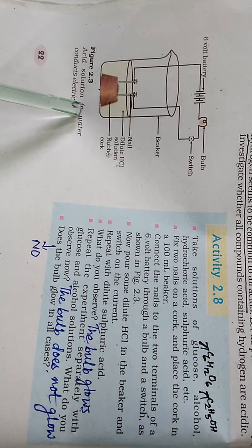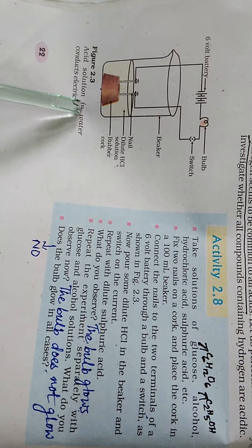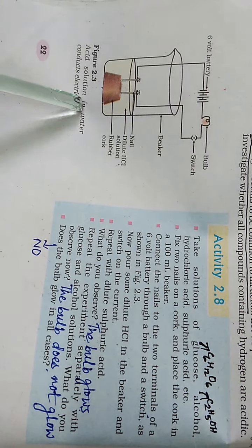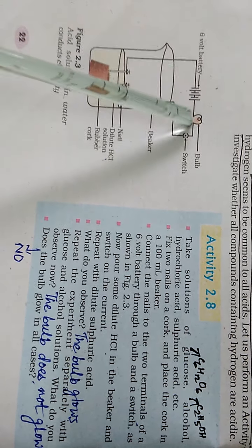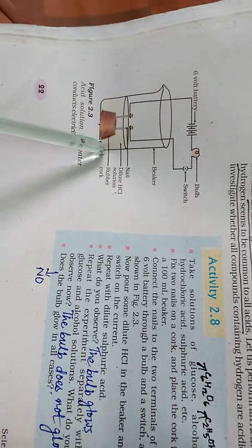in figure 2.3. We fix two iron nails on a cork and place the cork in a 100 ml beaker. Then we connect the nails to the two terminals of a 6-volt battery through a bulb and a switch. We pour about 50 ml of dilute hydrochloric acid in the beaker and switch on the current. We observe that the bulb glows.